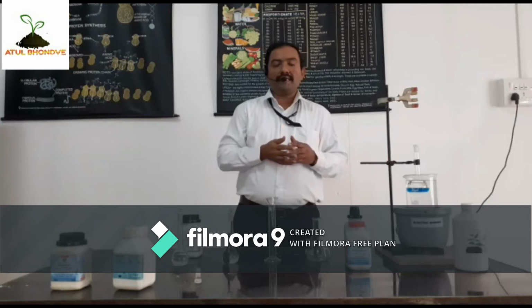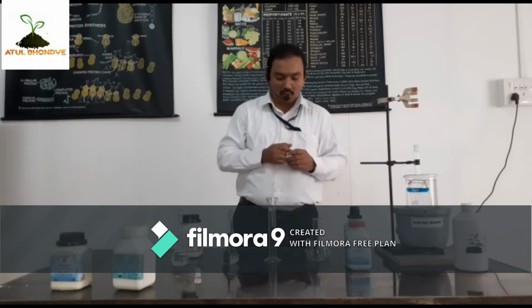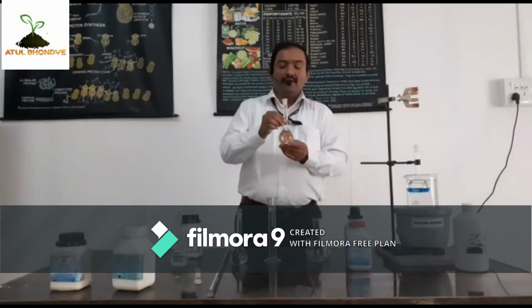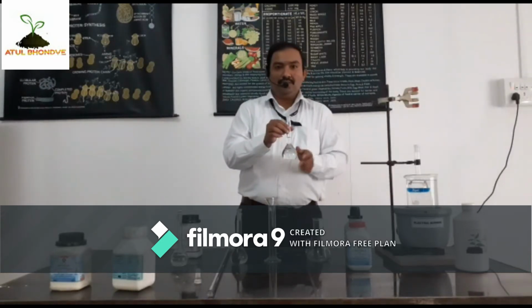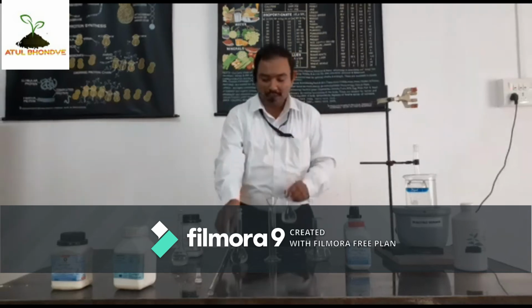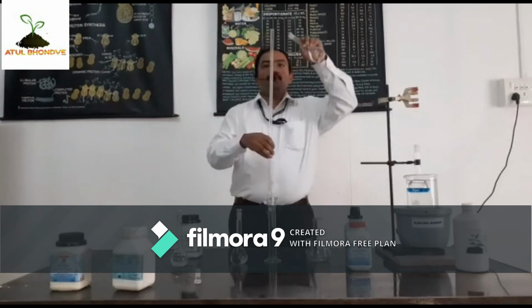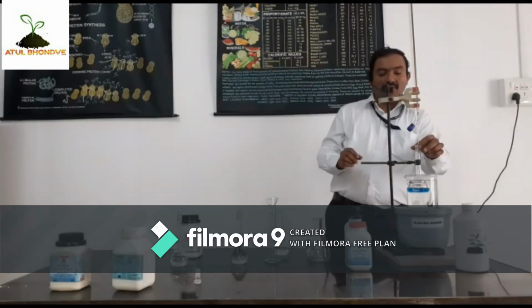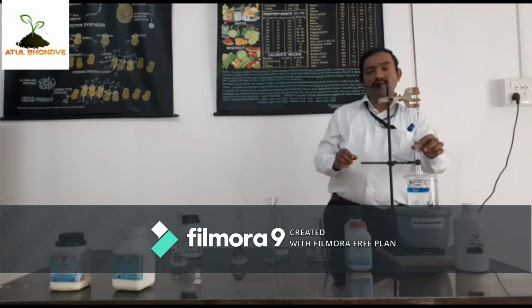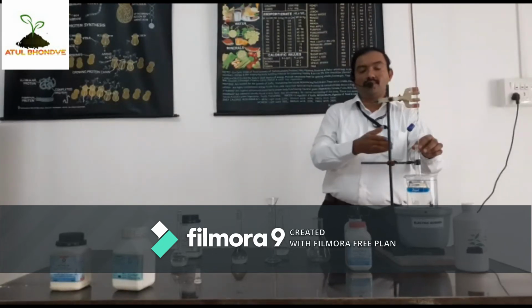The next step of this practical is the addition of standard glucose solution. We already prepared the standard glucose solution, and now we will add it into the burette. Then comes the drop by drop addition of standard glucose solution into the 25 ml of Benedict's reagent, which we are boiling on the water bath.